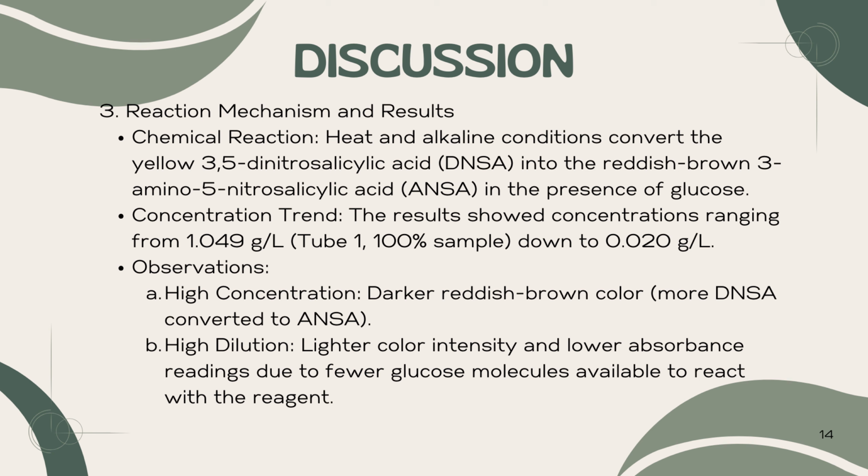Observations. High concentration: darker reddish brown color, which means more DNSA converted to ANSA. High dilution: lighter color intensity and lower absorbance reading due to fewer glucose molecules available to react with the reagent.